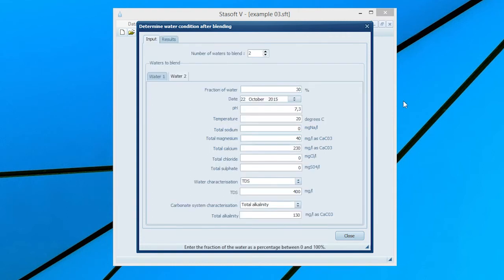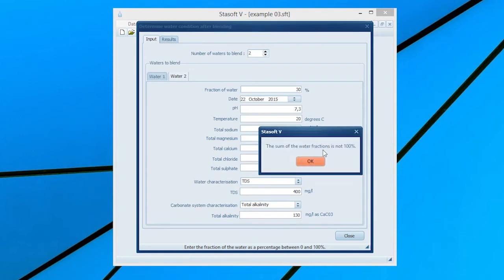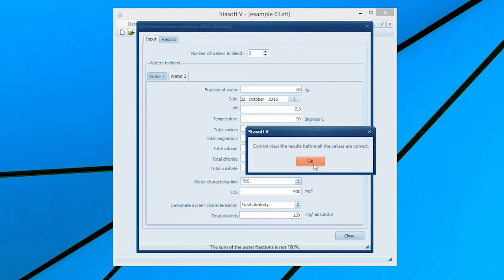In the event of incorrect water fractions entered for the relevant two or more waters to be blended, notification messages will appear subsequently on the screen and no results will be calculated.